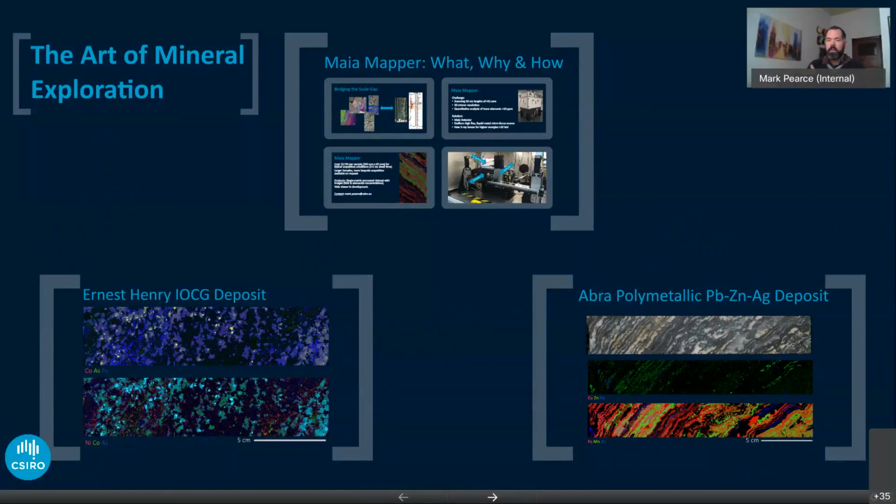Great, yeah, so I'm going to give an overview of the technique, and I've provisionally entitled this The Art of Mineral Exploration, because as you'll see, a lot of these data sets that we're going to discuss today are actually extremely beautiful images and contain a lot of data. Primarily the data sets we're going to discuss today are micro XRF maps, and they come from an instrument called the Maia mapper.